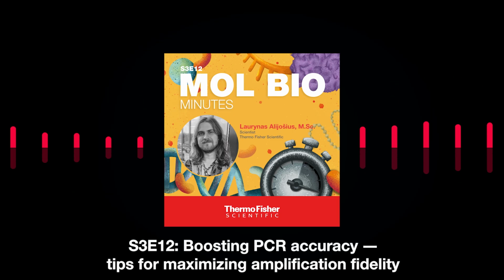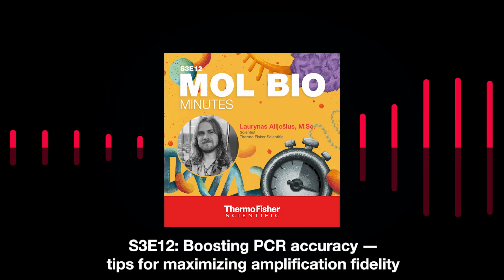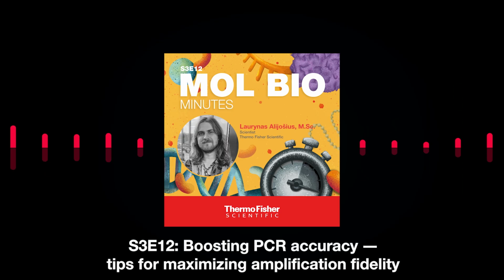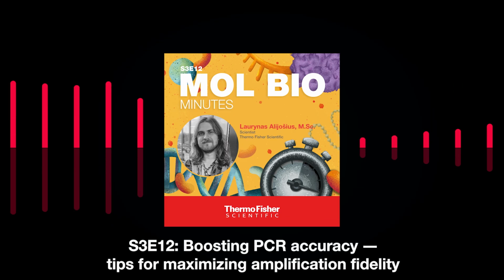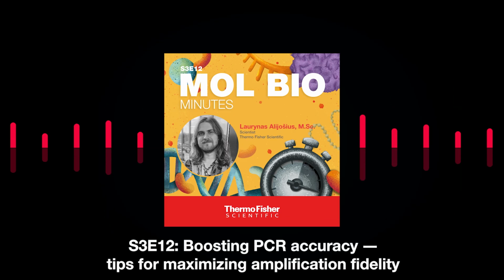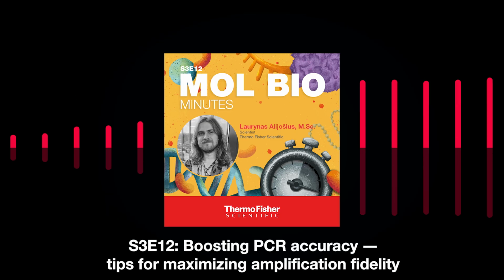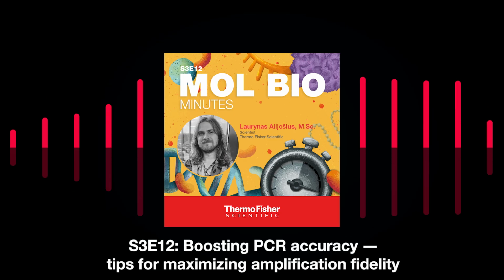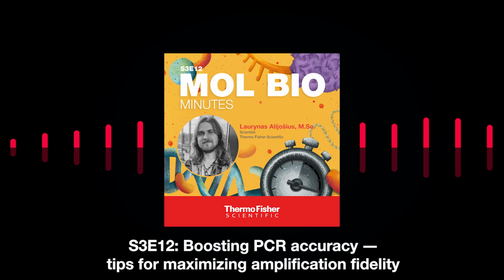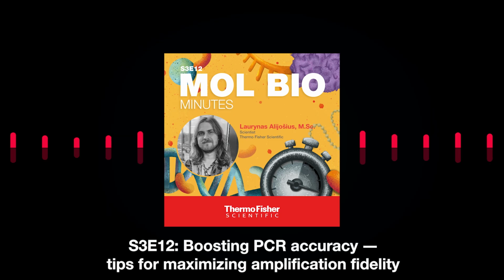So we figured out that components impact the accuracy of the PCR, right? But what about the cycling conditions? Does it also affect the accuracy of the PCR or not? Well, the answer right here is yes. Suboptimal cycling conditions can also lead to inaccurate PCR, unfortunately. So, for example, if you use very long denaturation times, that can increase the likelihood of non-specific binding and eventually lead to some amplification errors.